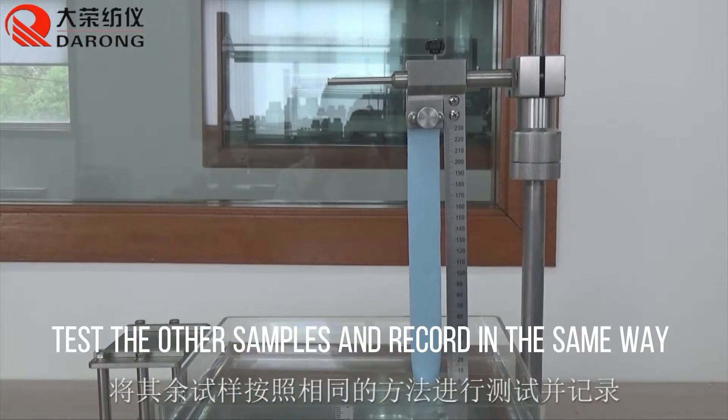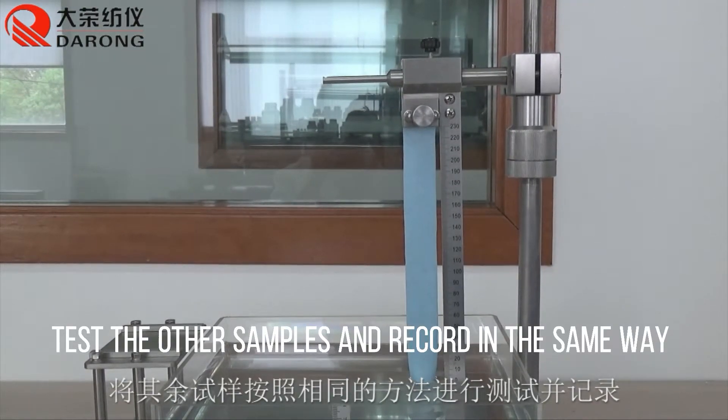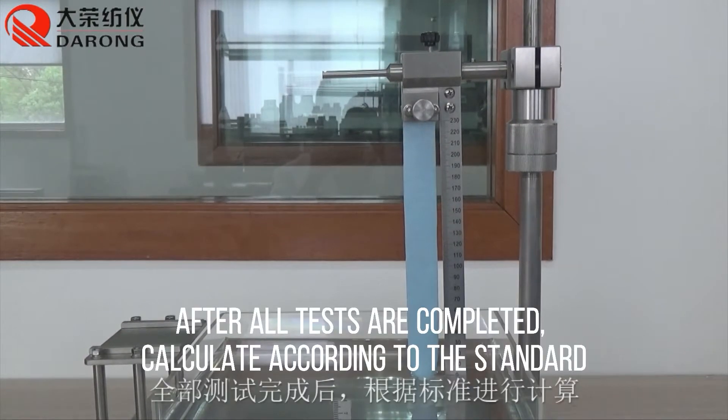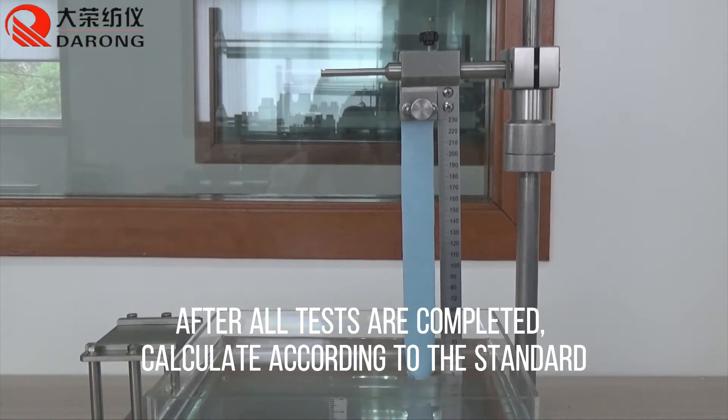Test the other samples and record in the same way. After all the tests are completed, calculate according to the standard.